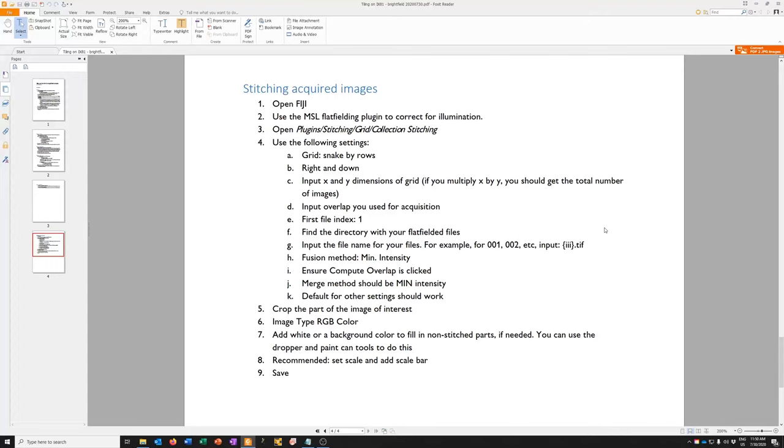Hi, I'm now going to show you how to stitch images that you acquired using tiling on the iX81 with Velocity. What I have open here on the screen is a PDF of the instructions, and we're just going to go through these things step by step to get this done.